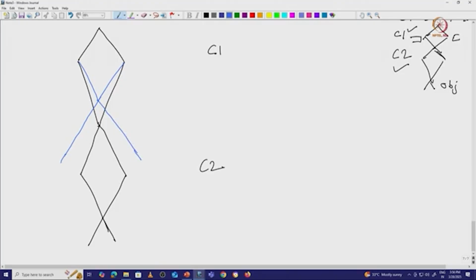When the electrons converge a little higher up, the beam can spread when it crosses the C2 lens. In C2 we are not changing the magnetic field at all. In this lens system, we are changing the magnetic field only in the C1; C2 is fixed at this moment. Since it is fixed, this electron beam is definitely more spread than the black ray, and the blue is more spread than the black. With the same magnetic field for the C2 lens, the converging point is going to change, there is no doubt about this. So it will change like that.